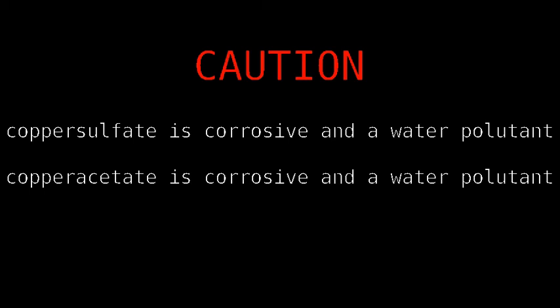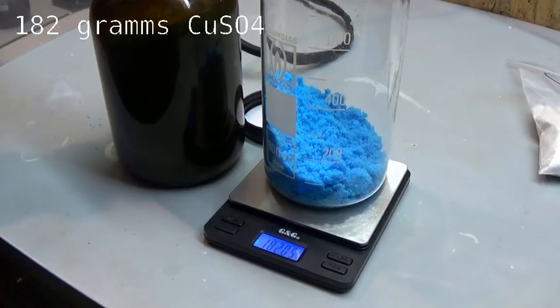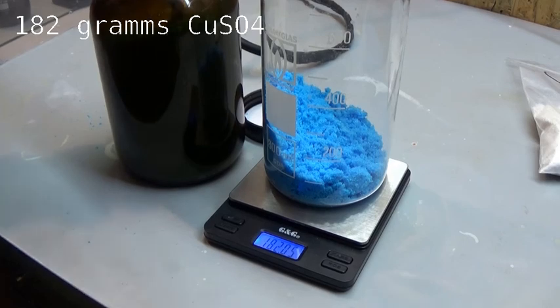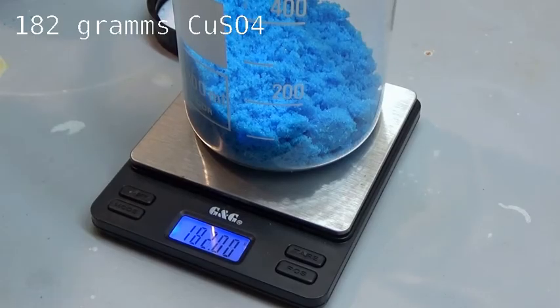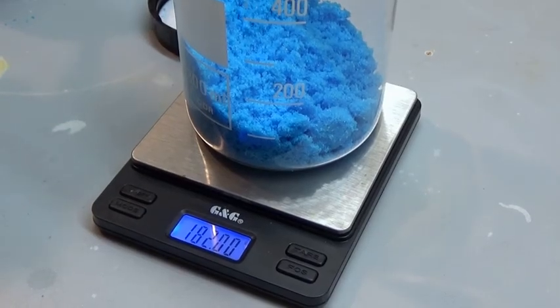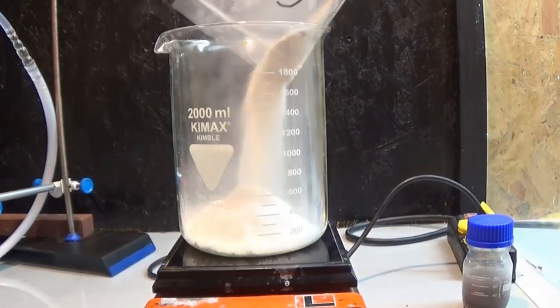Hello you all, in this part of the lead acetate synthesis I am preparing copper acetate by reacting the previously made calcium acetate with copper sulfate. For this I weighed out 182 grams copper sulfate.